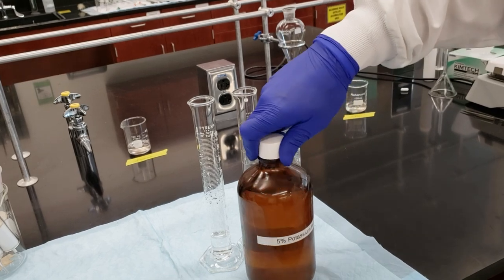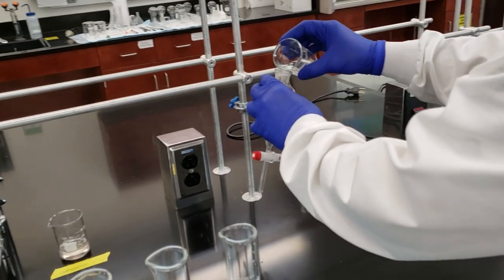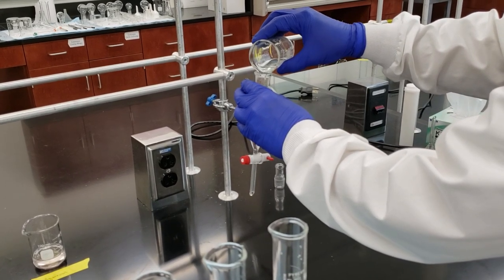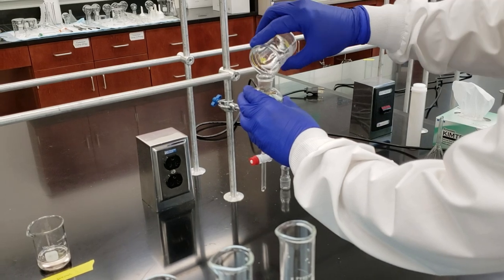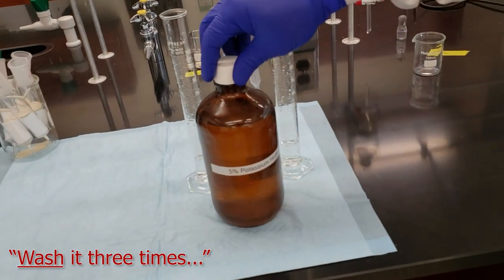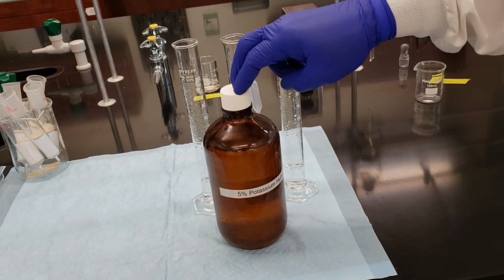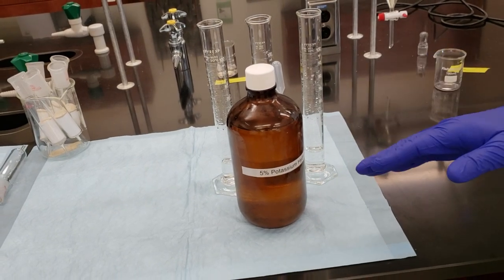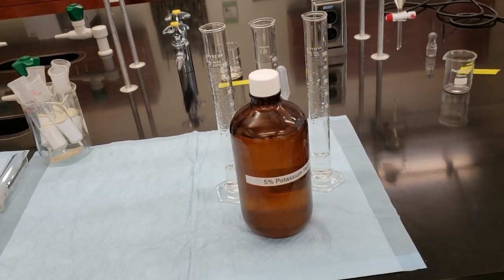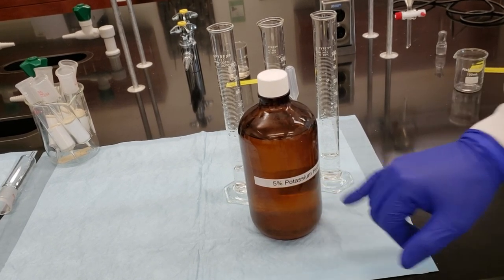So the next step of our extraction is to extract our combined diethyl ether layers. We're going to pour that into our separatory funnel. This is where our product is currently residing. Okay. And we're going to extract it three times with 15 mils each, so 15 mil portions of our 5% potassium hydroxide solution. Think about your starting materials and your product and ask yourself the question, what is the purpose of washing with this 5% potassium hydroxide? And remember, I use the term wash as opposed to extract. So we're washing with 5% potassium hydroxide.